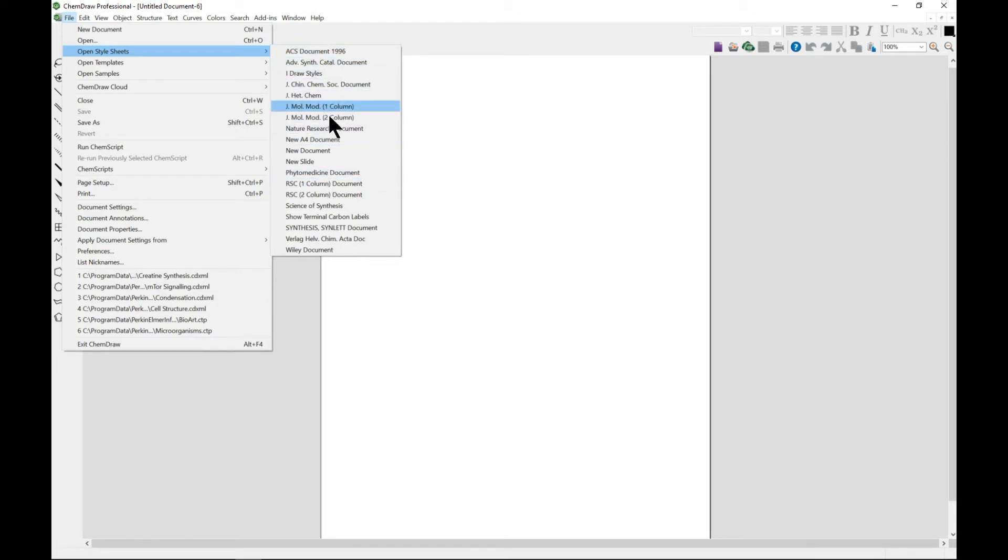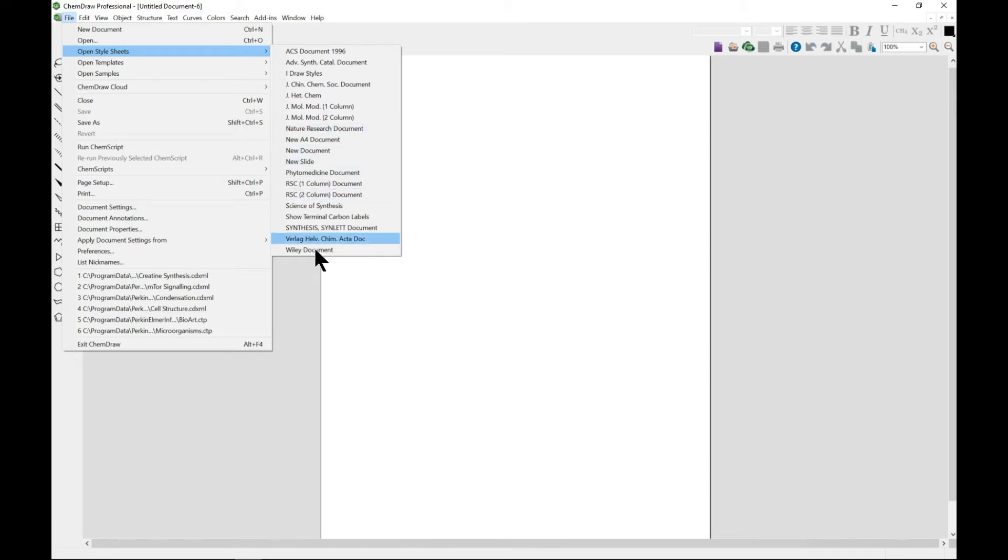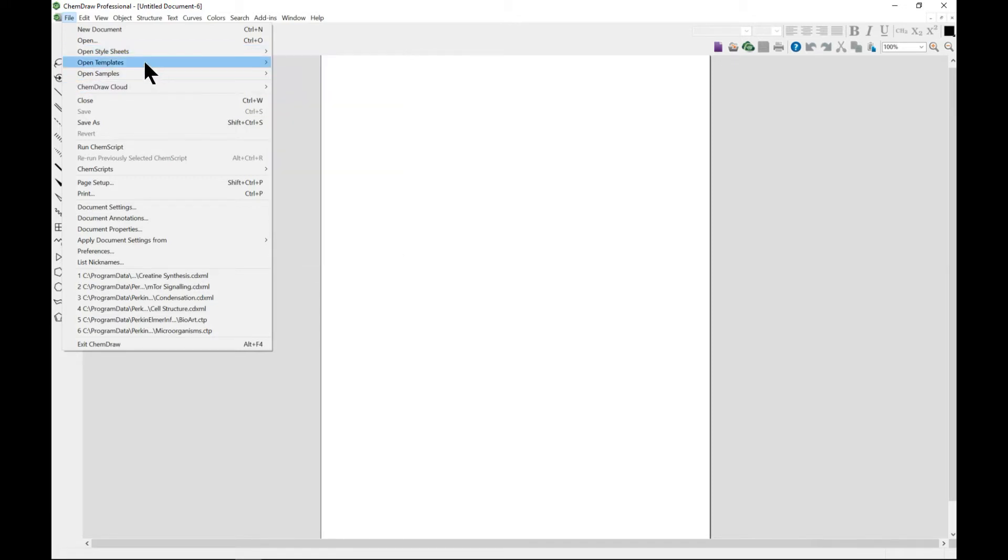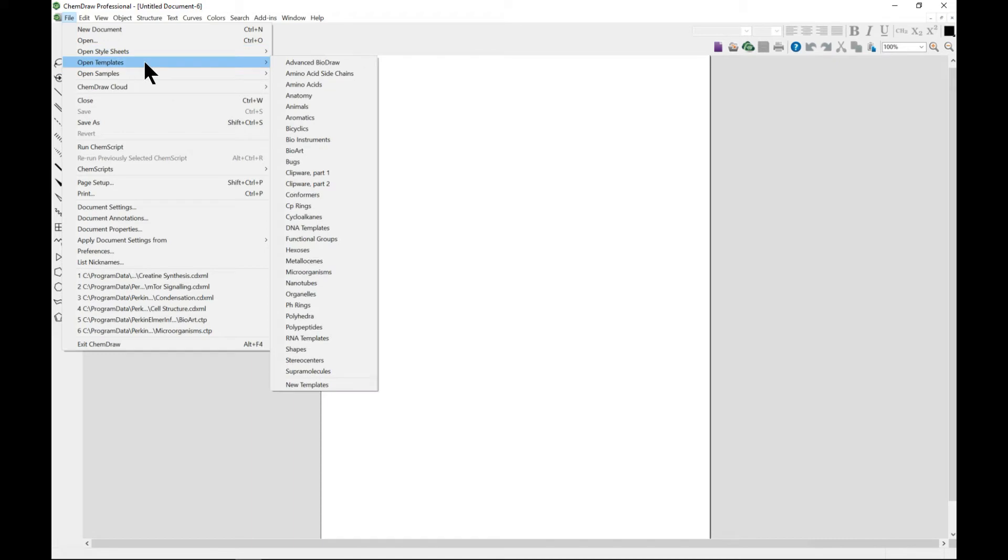If you're using Nature Research, so if you're going to publish in Nature, you should probably choose this and it has set parameters that go along with it. You can also open templates.